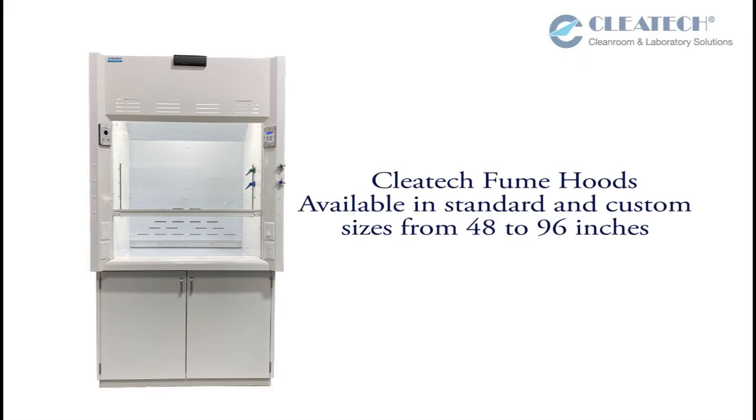Cleatech fume hoods are available in standard and custom sizes from 48 to 96 inches. Here are the unique features.